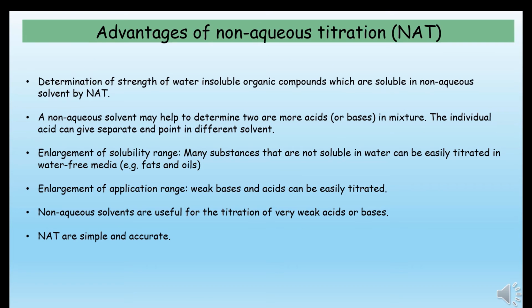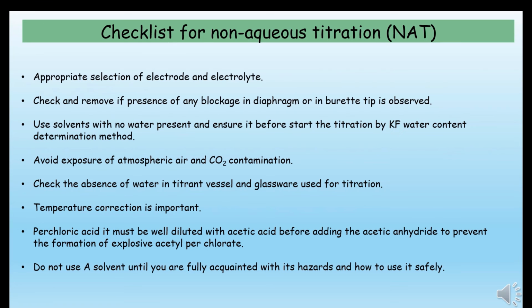Here, the advantages of non-aqueous titration are elaborated. And definitely don't forget to go through the checklist before starting any kind of non-aqueous titration. And here is the checklist for you.